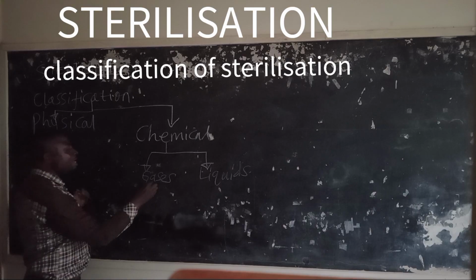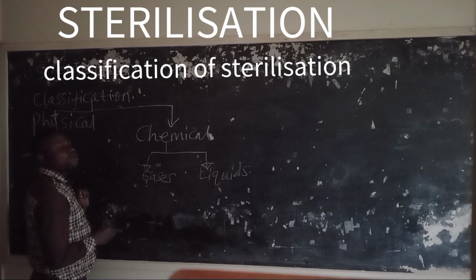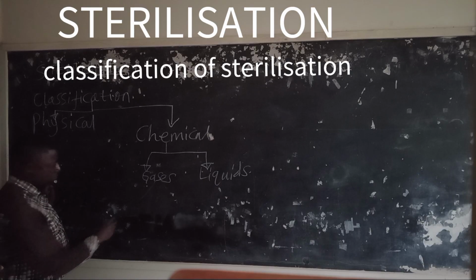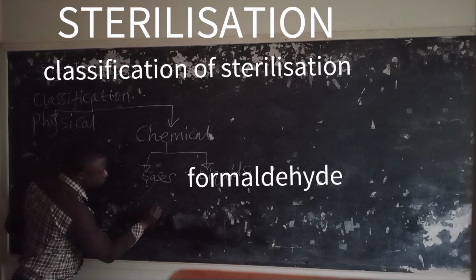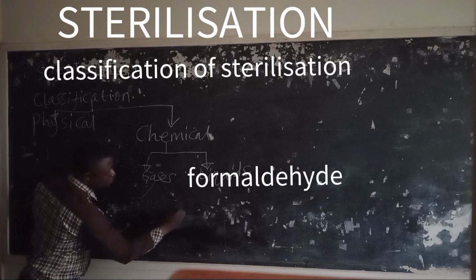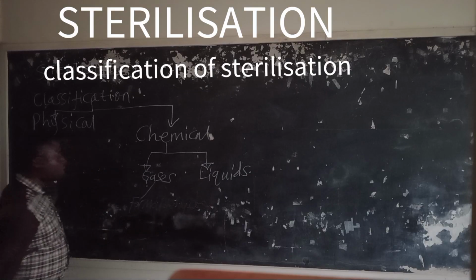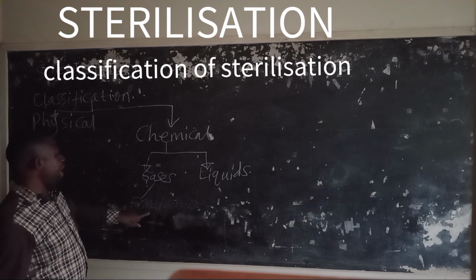Now, under gases, we have an aldehyde we call formaldehyde. We have a gas we call formaldehyde.